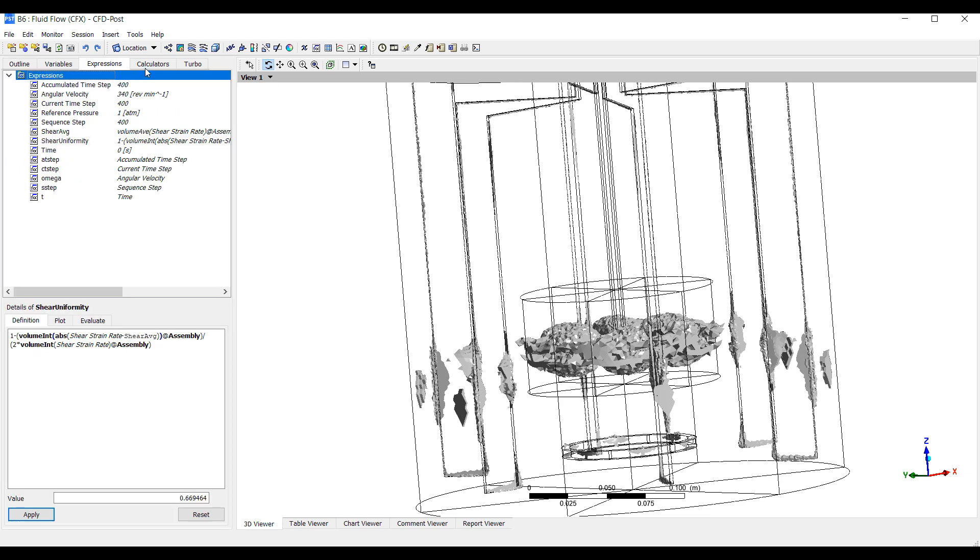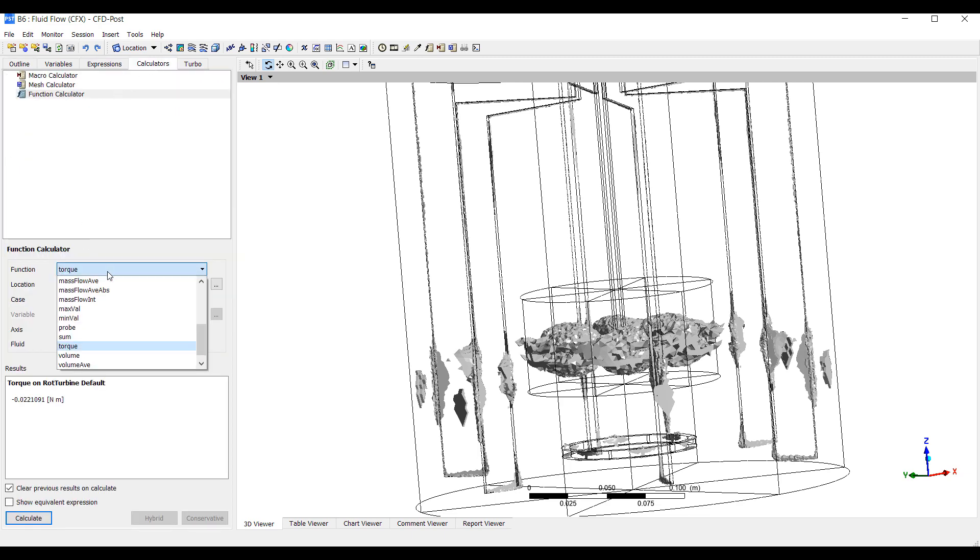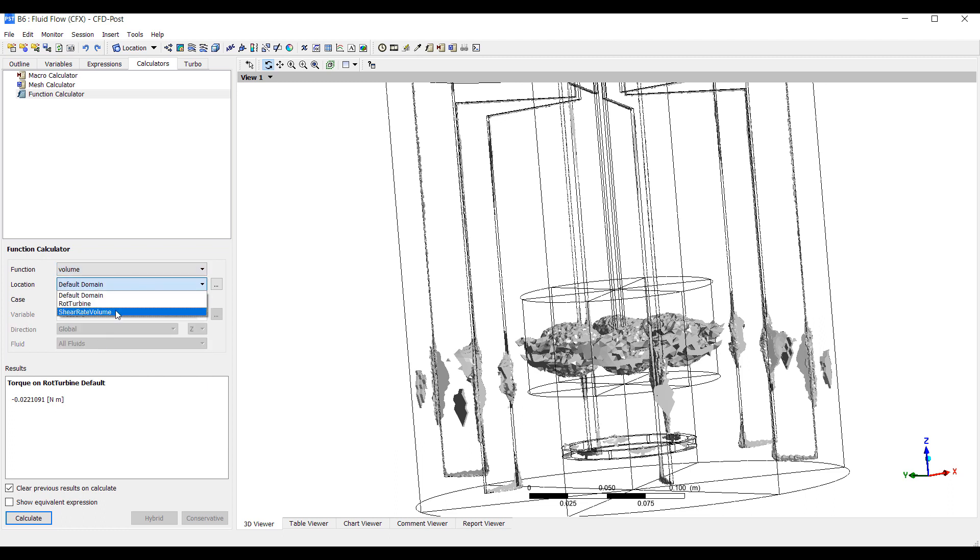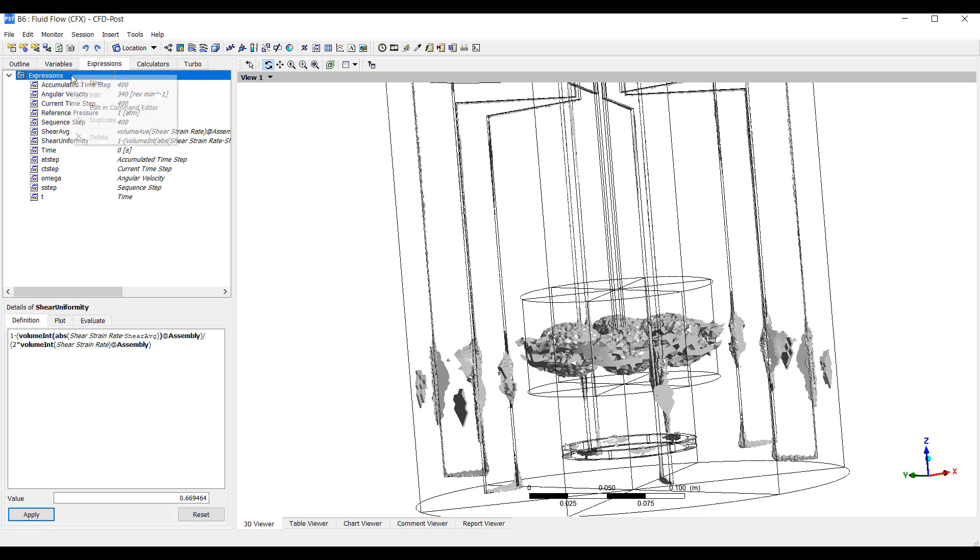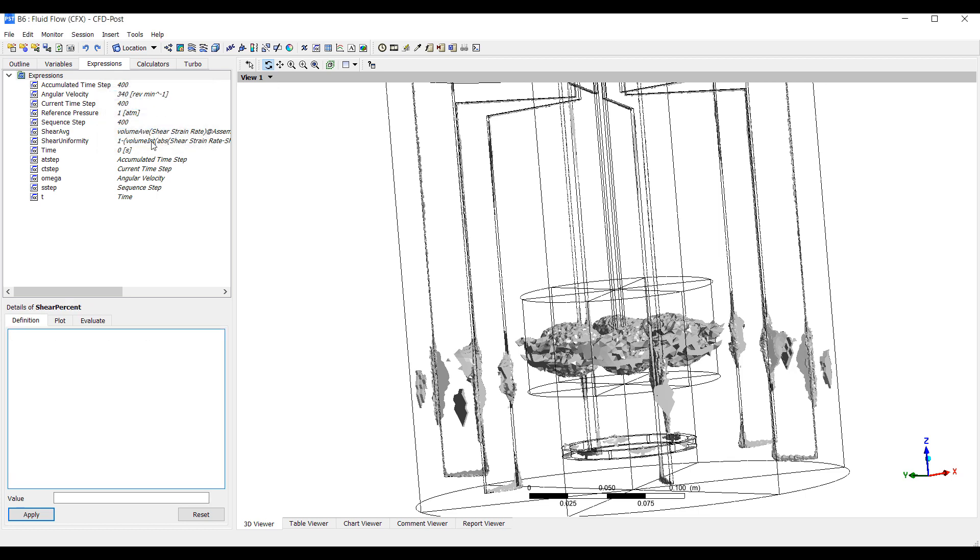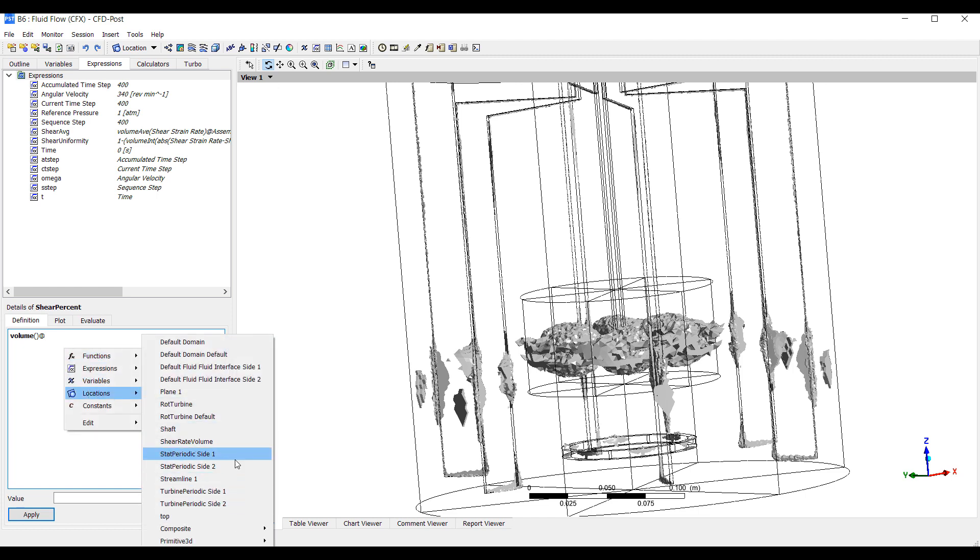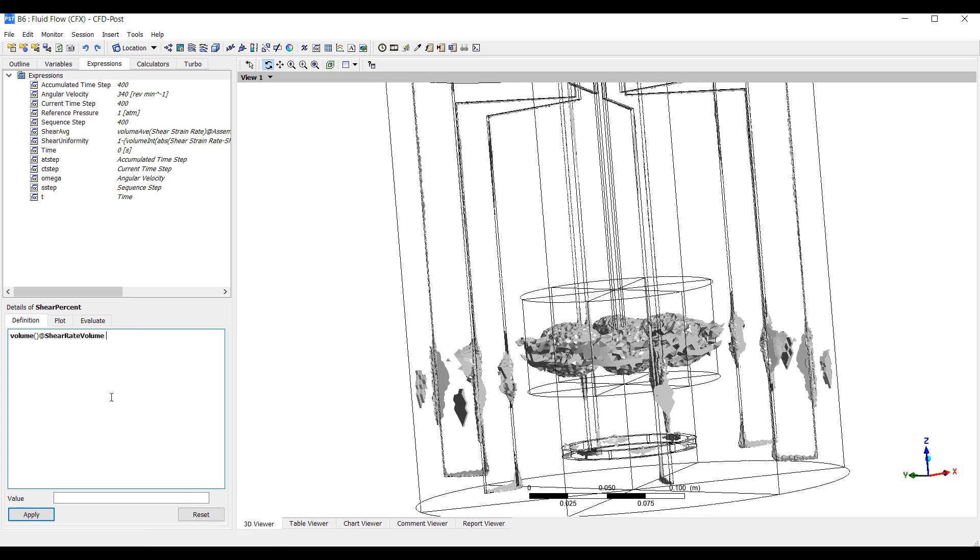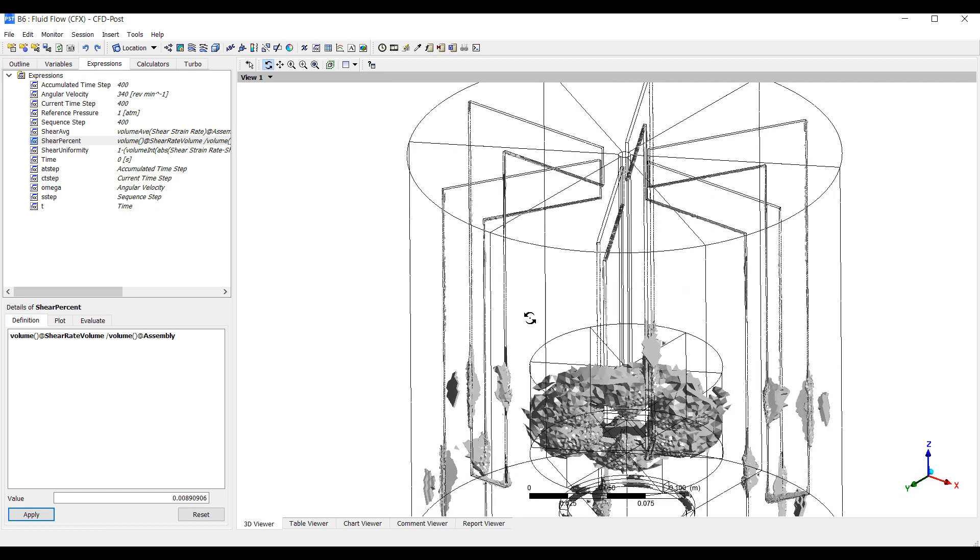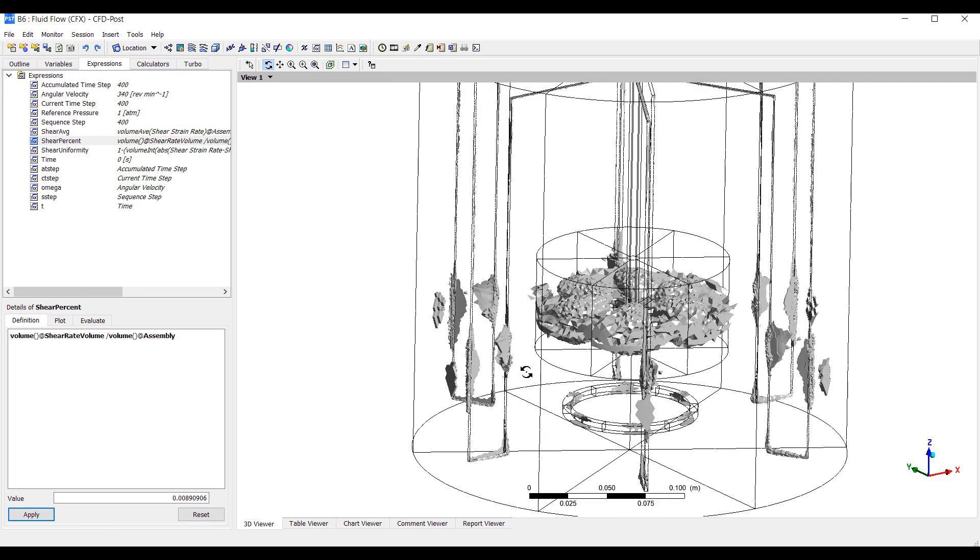And we can calculate the area. So we can write an expression or we can just calculate the volume here. So that's how big it is. If we want to know this as a fraction, we would have to write an equation. So shear percent. We can say volume at shear rate volume divided by volume at assembly. So less than 1% of the control volume here has a shear rate higher than that value, which allows us to calculate how much damage has been done.